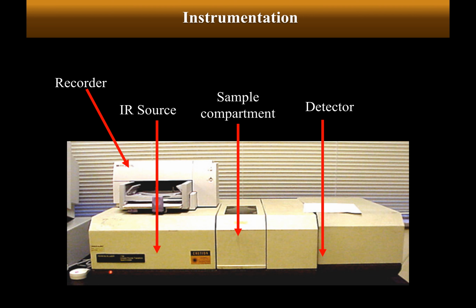Okay, you need an IR radiation source, and then this has to pass through the sample, which is to be kept in the path. After the sample absorbs certain things, whatever is the transmittance is to be detected by the detector, and it has to give the output in the form of a recorder. Fine.